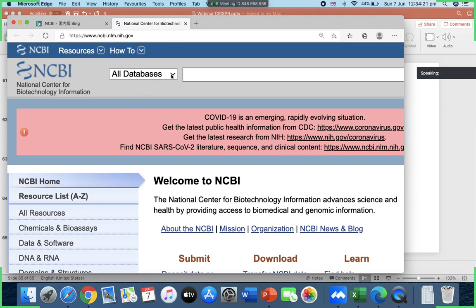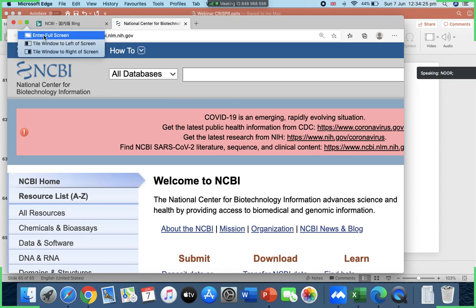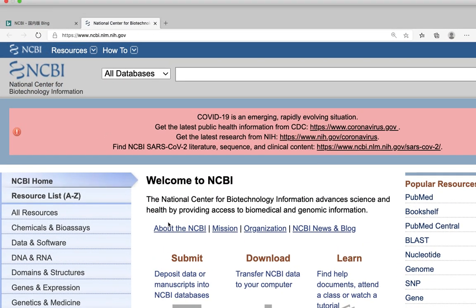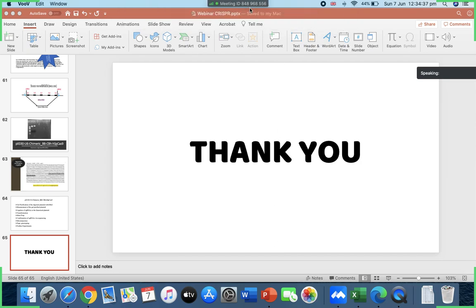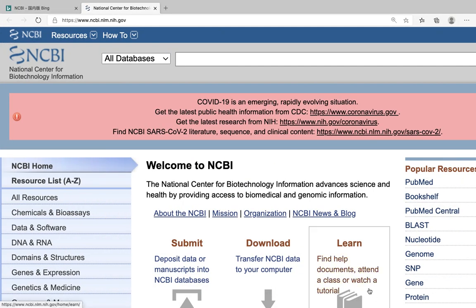All databases, I don't want to go for all databases. Let me make it full screen. All right, so we need to go to NCBI.